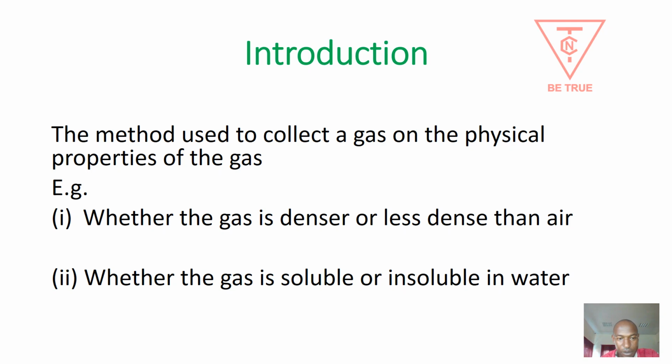Another factor we depend on is whether the gas is soluble in water or insoluble in water. If the gas you are preparing in the laboratory is soluble in water, you cannot collect it over water because it will all dissolve and you will have no sample to collect.